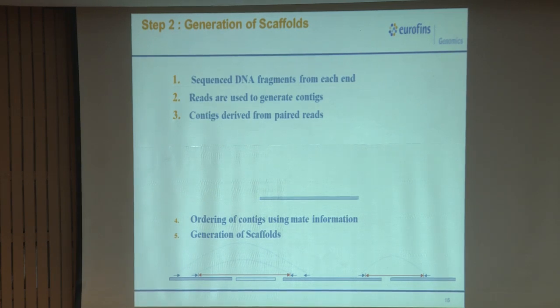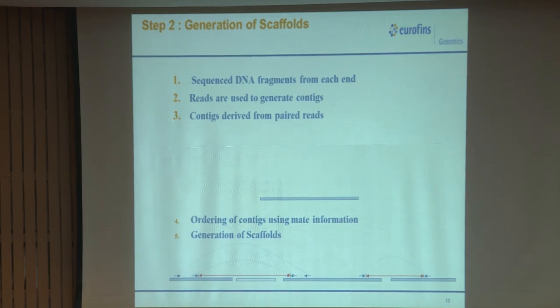That depends again; if you are using one software and you have optimized it, you can use it. Now, there are softwares which use both algorithms, like Masurca uses both, so you eliminate all your errors of assembly at least. Then you go for gap filling with different softwares. Then you have different libraries like MatePair, PacBio and all, and those can fill up these scaffold ends in between.